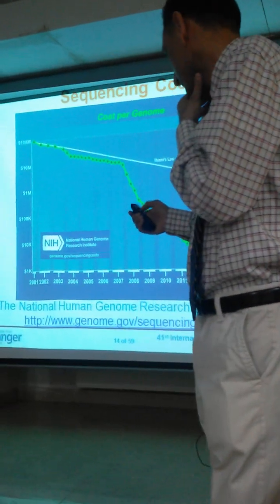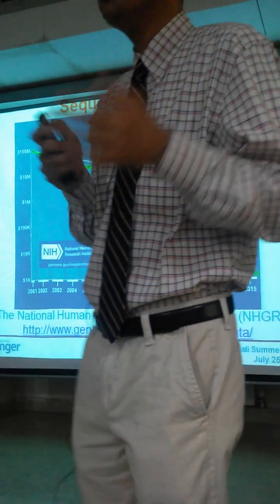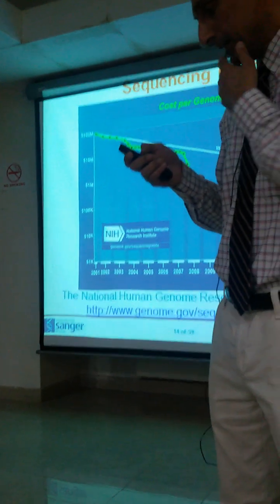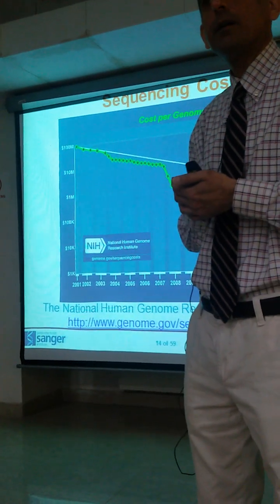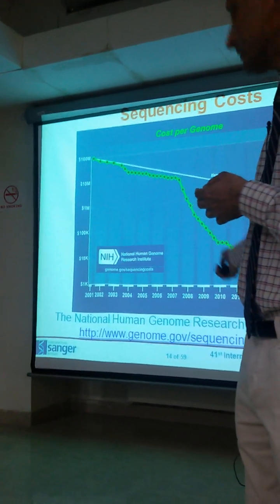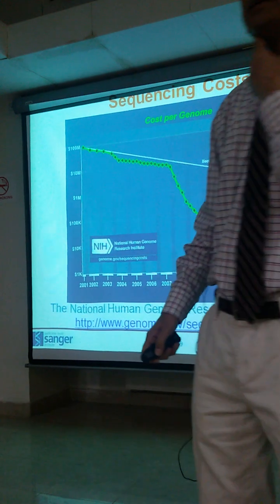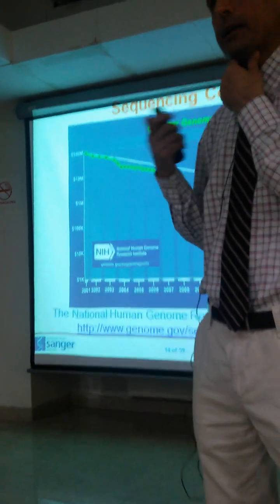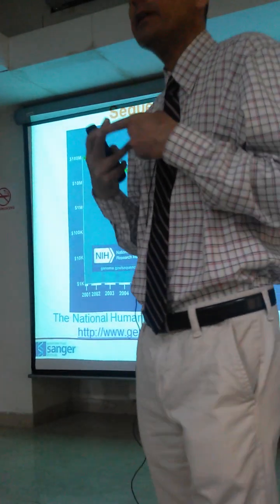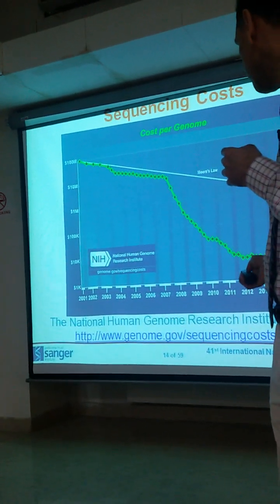What happened since the genome was published in 2004 was that around 2006 and 2007, there's a new technology known as Solexa that was developed at the University of Cambridge, close to Sanger, and then basically it got bought by this American company known as Illumina, and the cost of sequencing started dropping dramatically, actually even more dramatically than the cost of computing. And so at the moment where we are in 2016, we can sequence one human genome for roughly $1,000, and whereas it took us 10 years to do the first sequence, today it takes us 3 days to do one high coverage human genome sequencing. Of course, the analysis takes much longer.